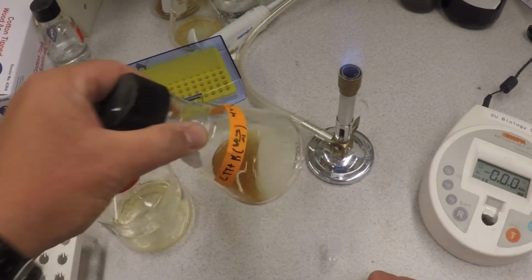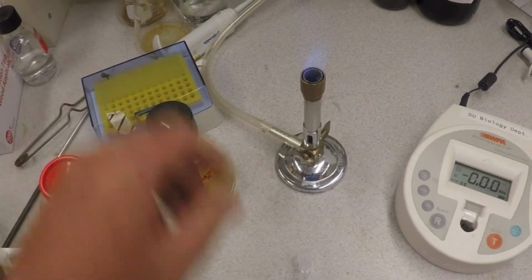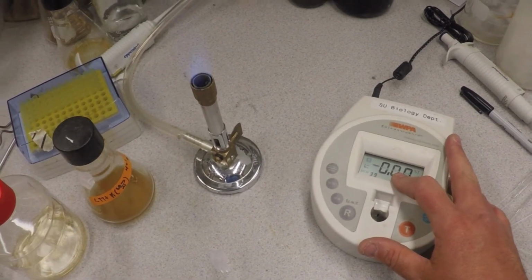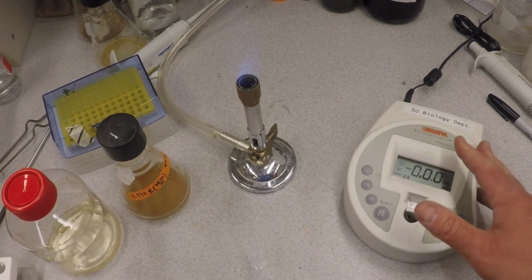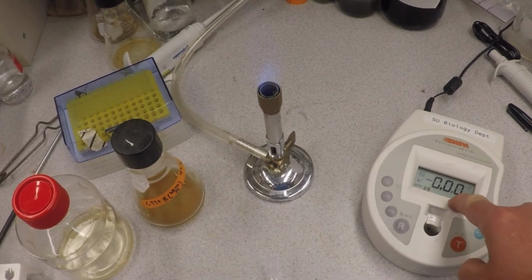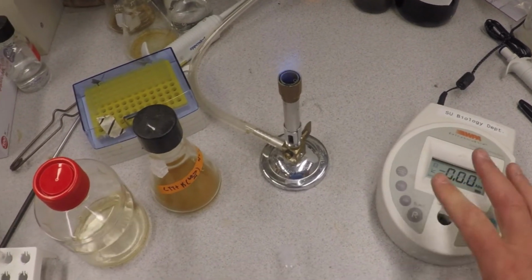The other thing you can do is use a spectrophotometer. Okay, so you can take this and put your sample into a spec and read the reading. In general, for at least E. coli, an absorbance unit or an OD of 1.0 is about 10 to the 9th cells per mil. Okay, that's a ballpark figure.